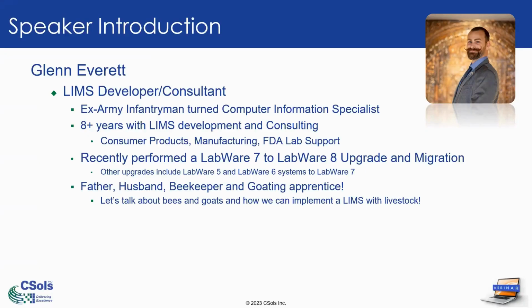I have recently performed a LabWare 7 to LabWare 8 upgrade and migration for a client. I've had other upgrades, including LabWare 5 and LabWare 6 systems to LabWare 7.